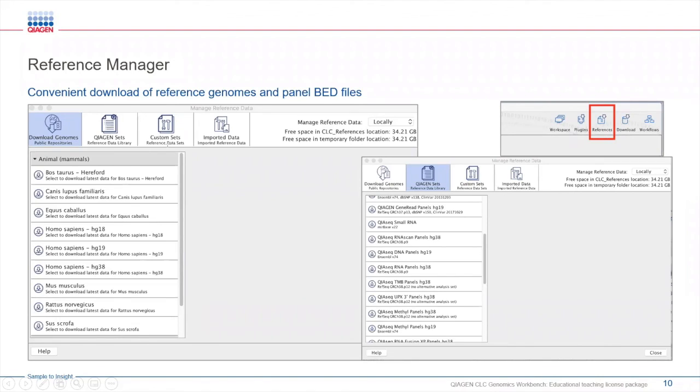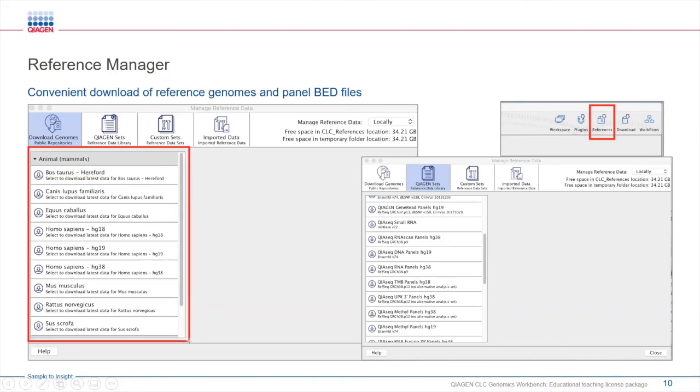The reference manager provides a list of references that you can choose from. Here we have references for a variety of species, plants, and other organisms like E. coli.